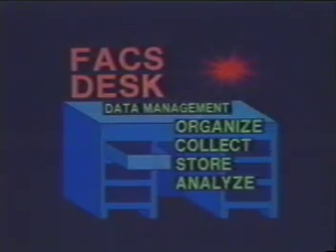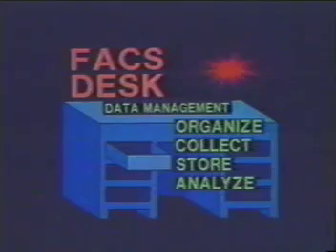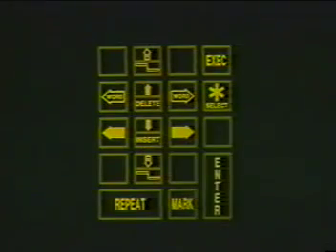It's not necessary to remember all of the keys and commands at once. It's more important to learn the command structure within each drawer. It would be a good idea to keep a magic keypad diagram handy while watching the rest of this video.